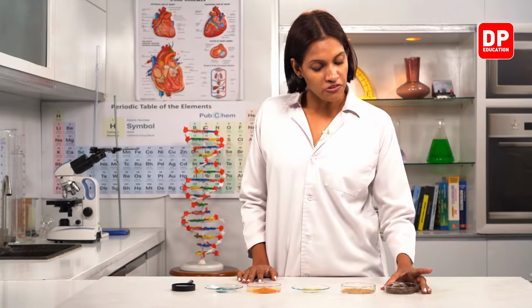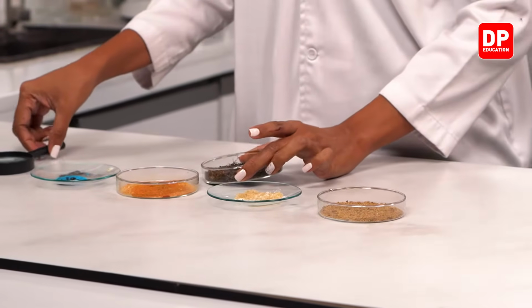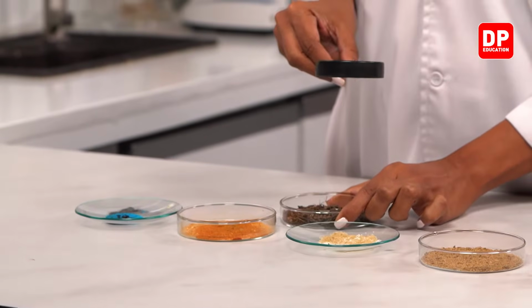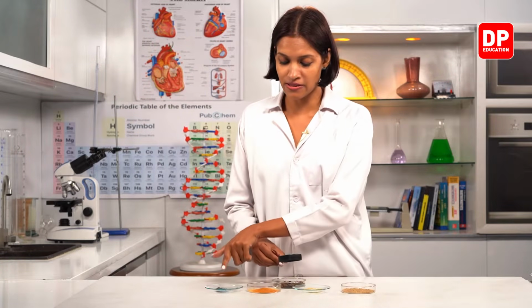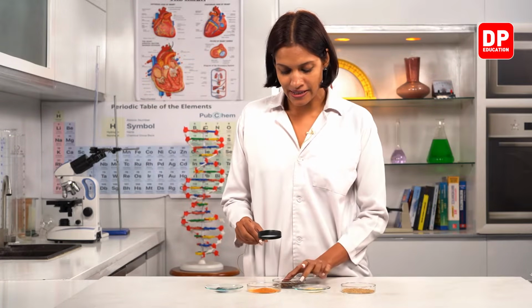Now we are going to observe different samples with the hand lens. Here first of all we have a soil sample. We'll observe this one first. If you have a hand lens, you all can do all these activities at home, right? Except for the chemical sample that I'm going to show you all today, okay.